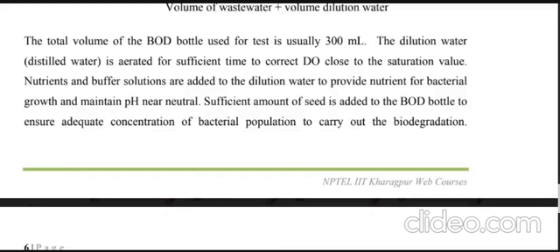Just like when there is a small kid, for the small kid we give a good type of food whose taste is good, and he can take that food happily. The same thing: nutrients are provided at the initial phase of the growth of the microorganisms, so that they start to grow and then they decompose. They are not directly given the organic matter which is available.